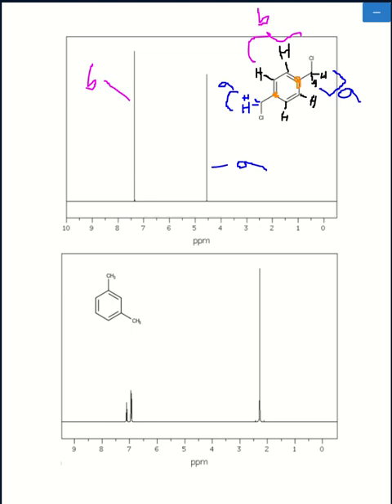Now, for the current examples shown, the hydrogen on that benzene ring have more or less all coalesced into one single peak. There will be examples where that is not necessarily true. For example, the bottom guy right here.